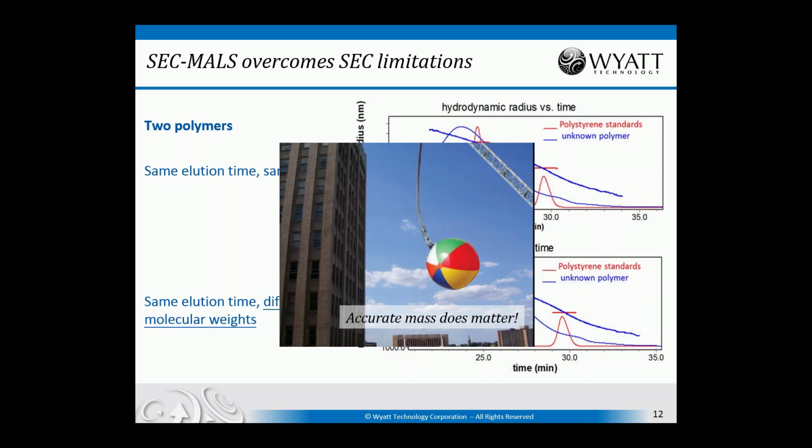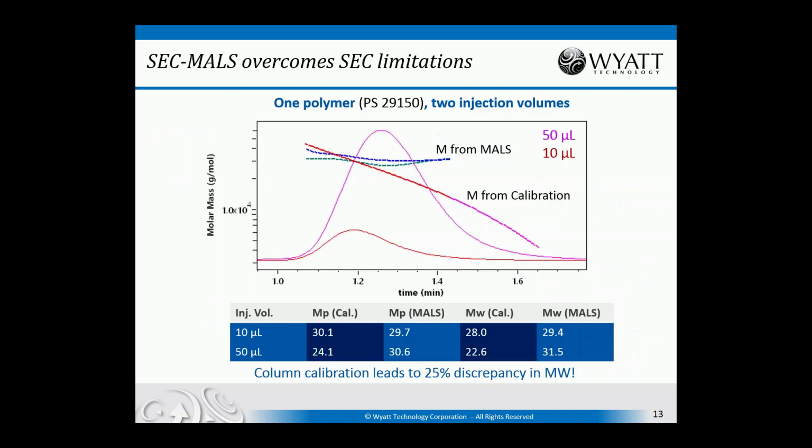Accurate molecular weight does matter. You can utilize the wrong tool in your measurement or in your application, and you can see that in this case, it's just not going to do the job. So it's important to make sure that we have the right molecular weight in our polymers.